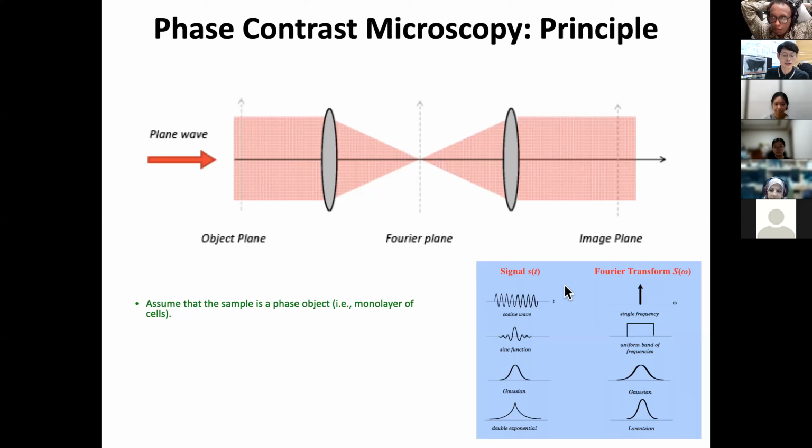If you're not very familiar with this, you should resort to a basic Fourier transform; there's only a couple, not even that many. That's why we are doing Fourier transform with a lens. Constant becomes a delta function. Again, this happens at the focal plane between the object and lens and the back focal plane. That's why we call this the Fourier plane. Does it make sense? Then let's go back to our 4F system.